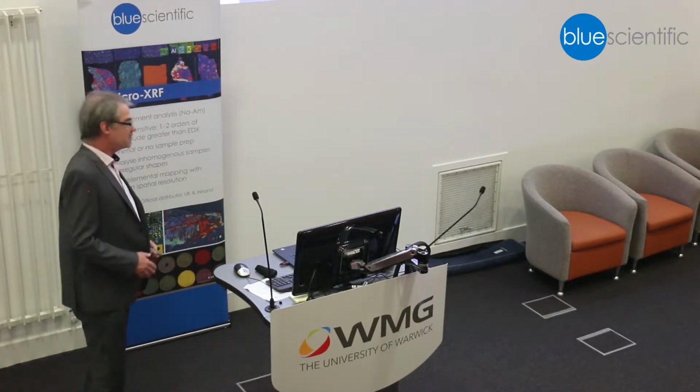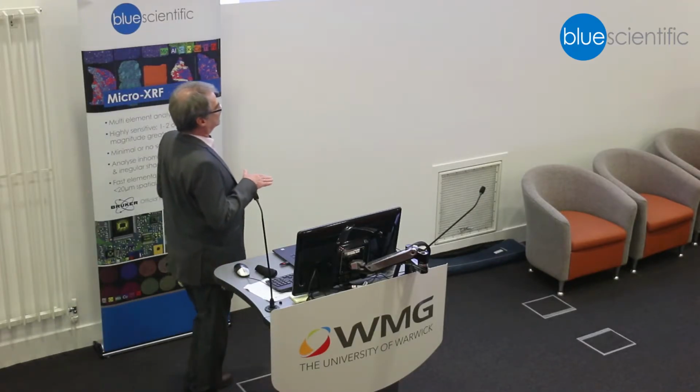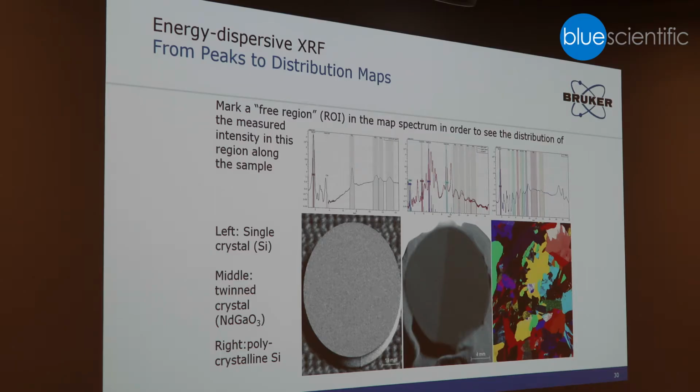What would happen if you deal with a single crystal? If a single crystal has a constant orientation, you would see a diffraction peak always at the same position and the same height. If your crystal orientation is changing depending on the position of your sample, then the diffraction peak position may change and the height may change. And this is illustrated here.